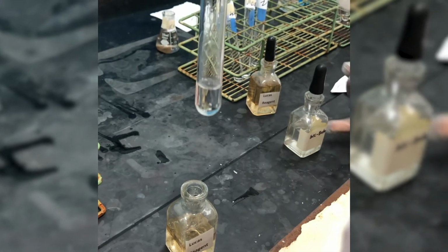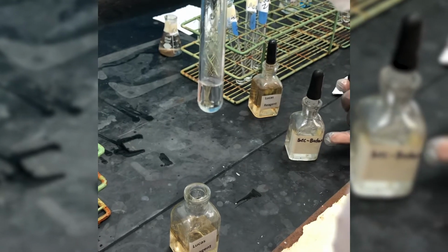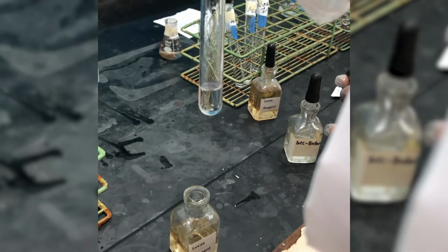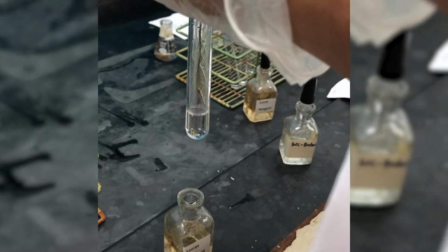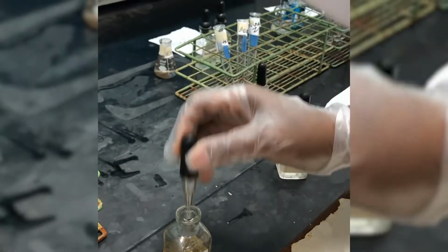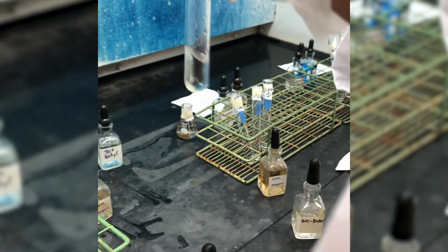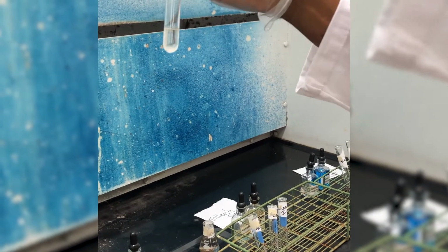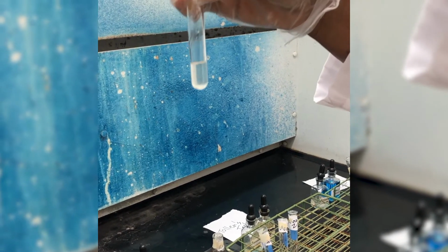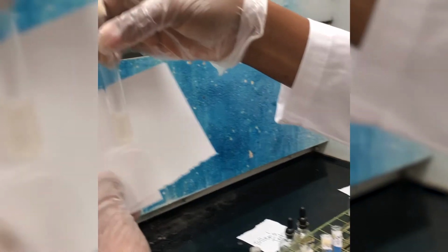So I just put in the sec-butanol. This is secondary butanol, a secondary alcohol. Now with Lucas reagent, you're supposed to see some cloudiness. It's there, it's just not very clear.